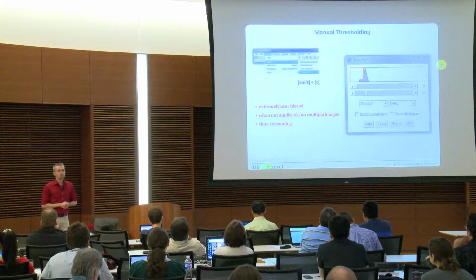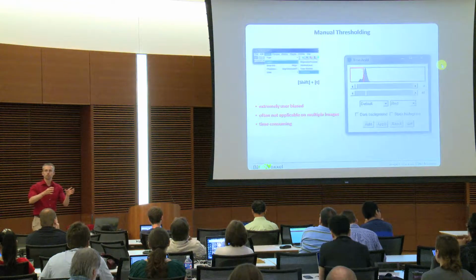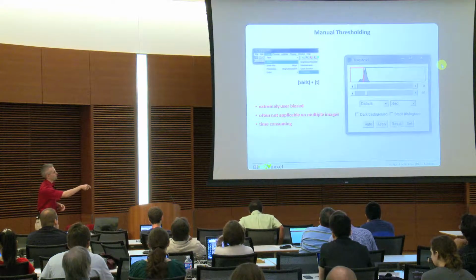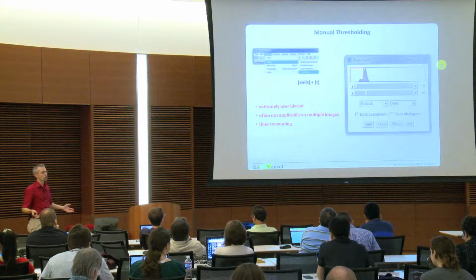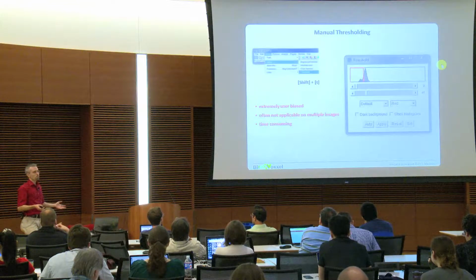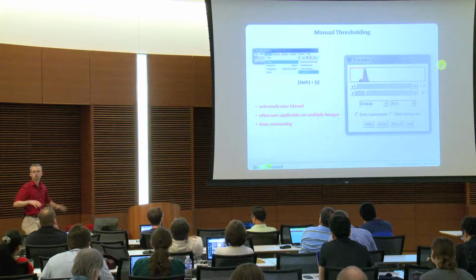Especially also a problem is that when you want to compare extractions of images to each other later on, you need to apply exactly the same cutoff values to all of your images. And this is where you actually have a problem, because your images have natural variances, and then it's actually not working anymore.